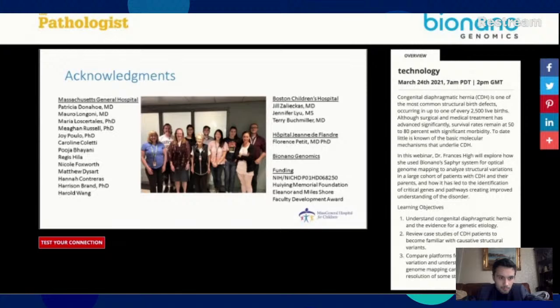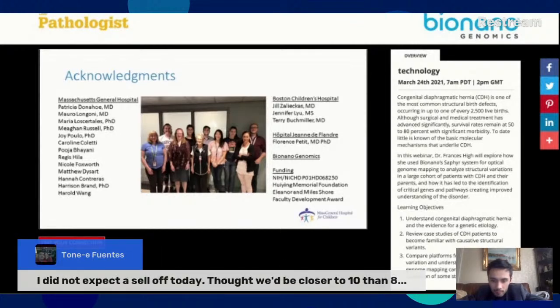Okay, great. And how much chorion tissue or amniotic fluid is necessary for prenatal analyses? Maybe I can address that. So right now we need to work with 1.5 million cells total. That means that these still need to be cultured. We are working on reducing the input material, but right now that is the requirement. So 1.5 million cells.